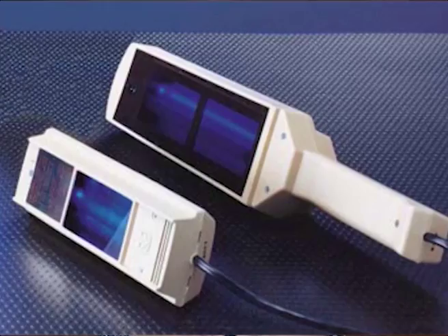The treated item is then allowed to dry under natural conditions for 5 to 10 minutes. Thereafter, it is exposed to either sunlight or light from an ultraviolet source or lamp until the best contrast between the developed fingerprints and the background surface is obtained. A sample fingerprint developed by silver nitrate reagent is shown here.